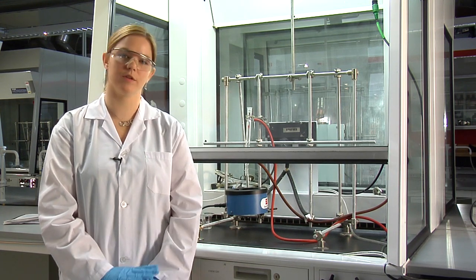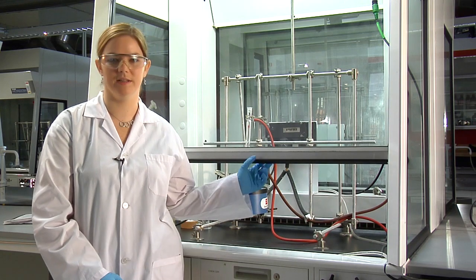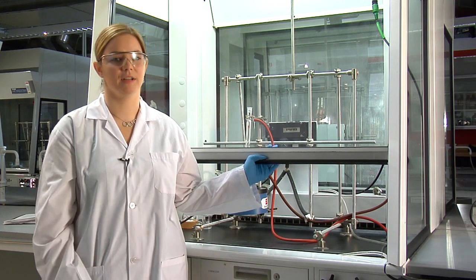On your first lab period, you need to come prepared with your pre-lab done and be ready to write the quiz for all 3 parts of the experiment. And again, a reminder that all of your experiments are to be done in the fume hood, but for the purposes of this video, we're going to be raising the sash and having it up high.